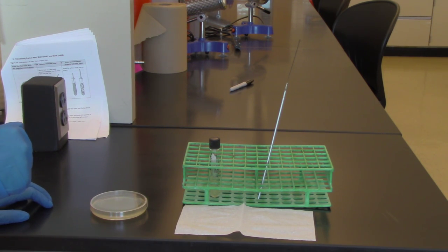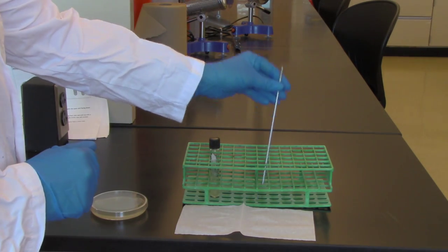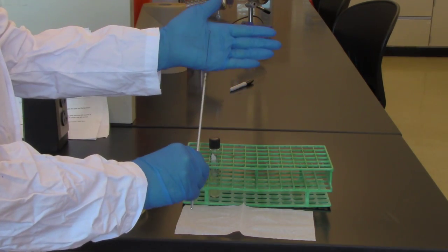This video shows how to inoculate a slant starting with culture on a petri dish. The tool I'm going to use here is an inoculating loop.